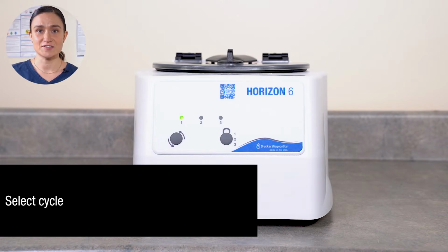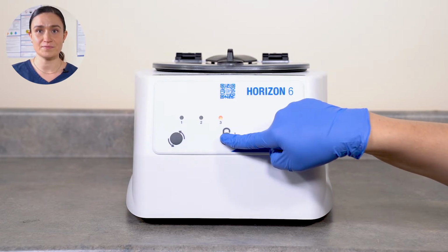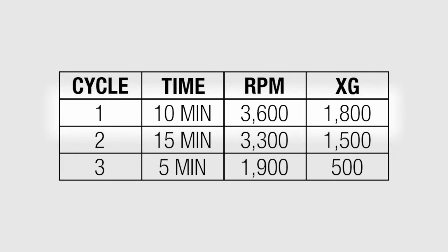Next, select your cycle. Use Stop Unlock to navigate between cycles 1, 2, and 3 as needed. In our case, we're going to run cycle 1. This cycle has a factory default of 10 minutes at 3600 RPM, which is 1800 XG. The other default presets are listed on your screen now for easy reference.